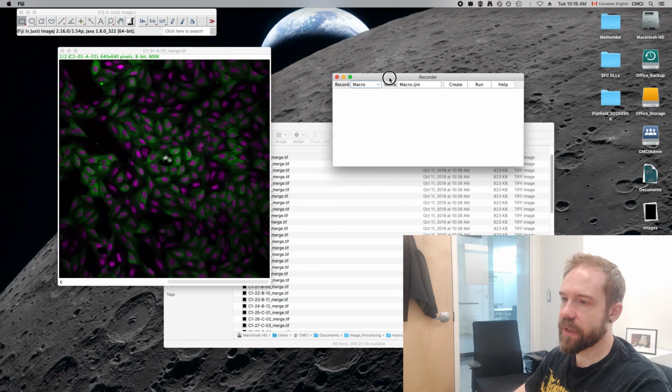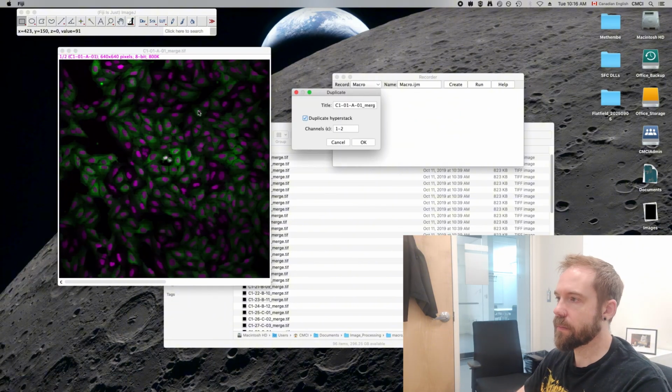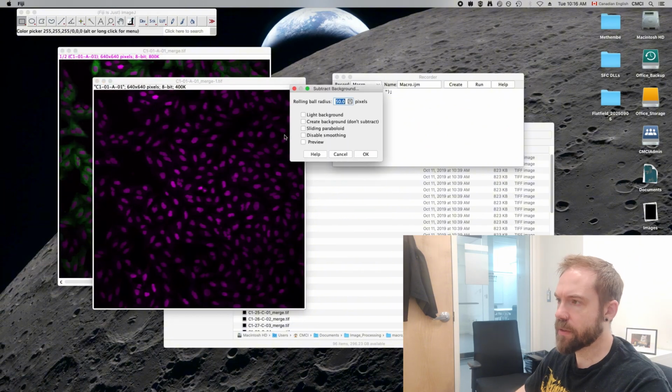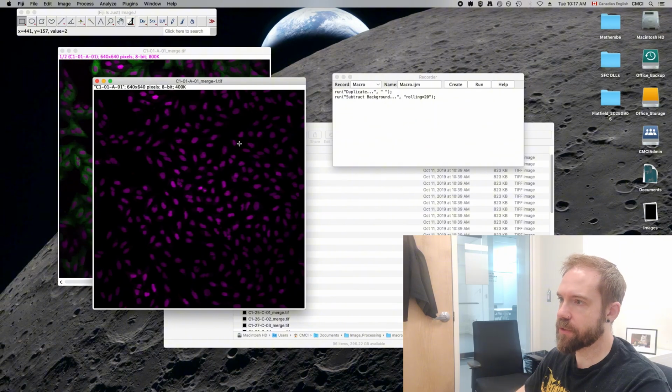Let's just say that I want to do a quick cell count. I'm going to duplicate channel 1. I'm going to do a quick background subtraction. Let's say 20, sure. And then I will threshold the image.